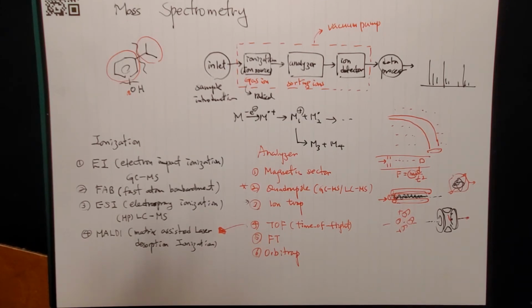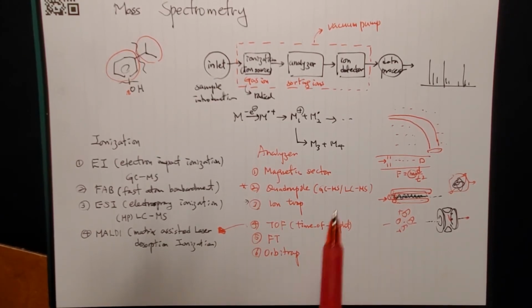Then you let them fragment more as you have them circulating, and you wait until you have enough fragmentation, and then you let the next one go out, and sequentially you can lose them. Then using the data, what came out in the order, you might be able to get some sequencing. I mean, some ideal case. So you can see the development of the idea.